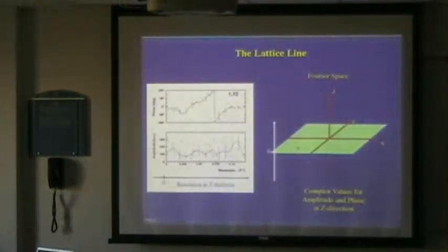So you see, again, we have a discrete spot, but in Z, along this axis, we have continuous phase and amplitude information. And that is our 3D information, ultimately. And that, brought back correctly, gives you the 3D data set.